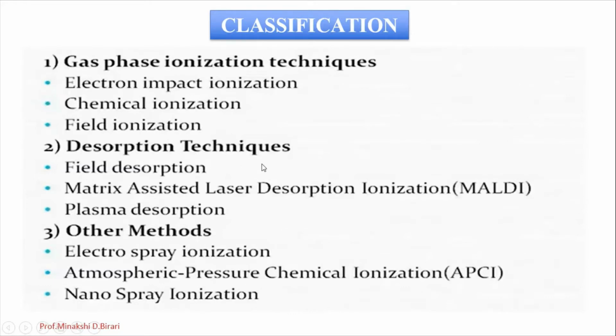Second, desorption techniques, that may be field desorption, matrix assisted laser desorption ionization, plasma desorption. Also, the other methods include electrospray ionization, atmospheric pressure chemical ionization, nanospray ionization.